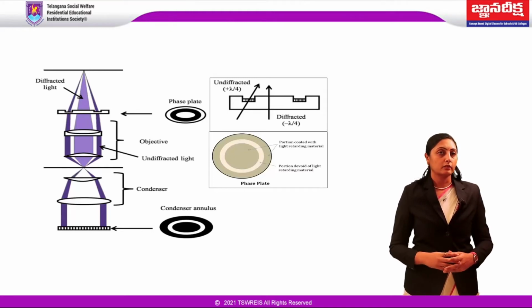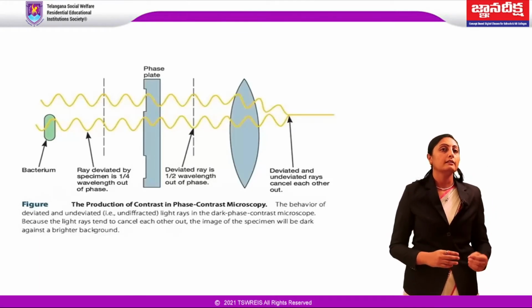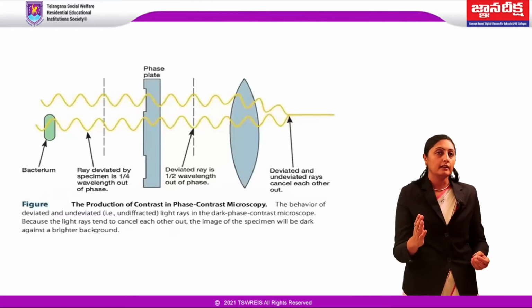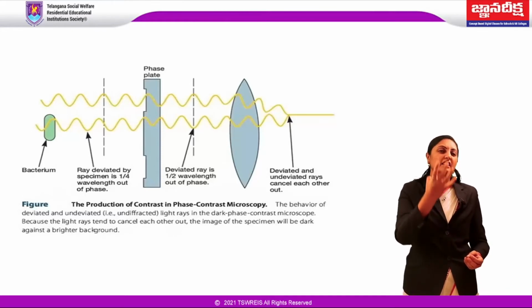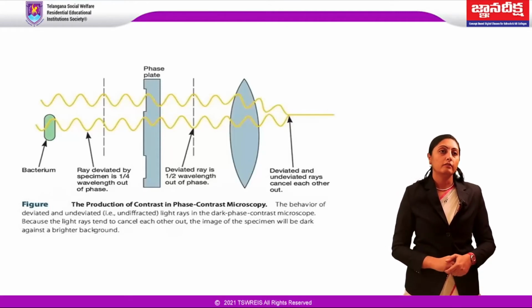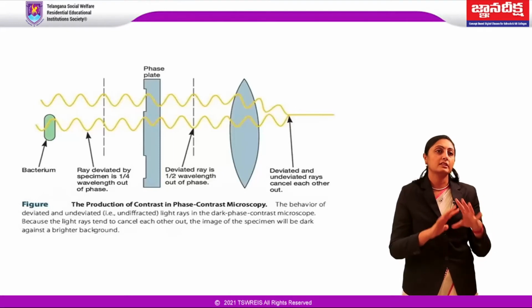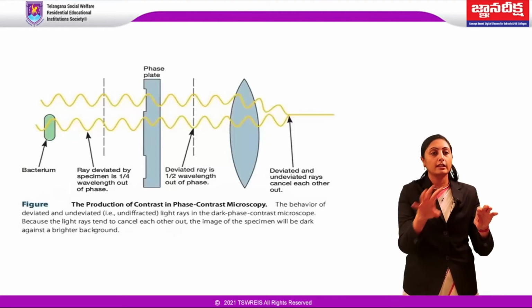In the phase contrast microscope, one set of light rays comes directly from the light source and is called the direct rays or undiffracted rays. The other set comes from the light source, but is reflected or diffracted from a particular structure in the specimen. The diffracted light passes through the light retarding portion of the phase plate and is retarded further by a quarter of a wavelength. When the two sets of light rays, direct and diffracted, are brought together finally, they form an image of the specimen containing areas that range from relatively light, through shades of grey, to black.